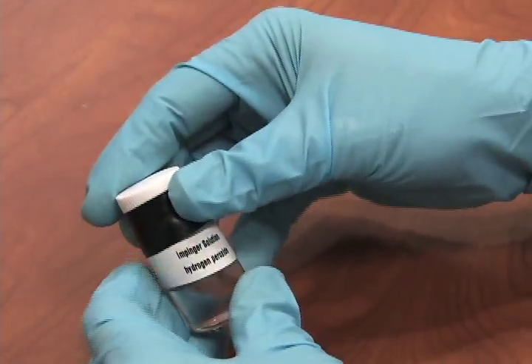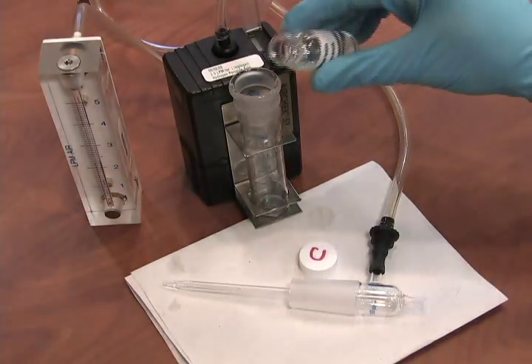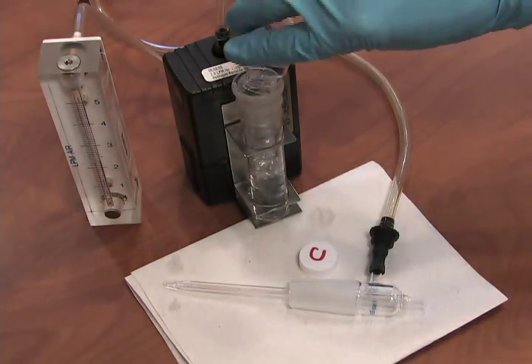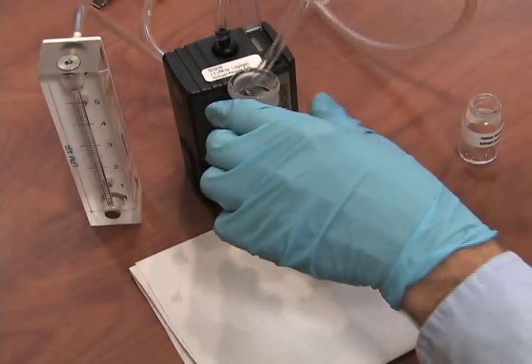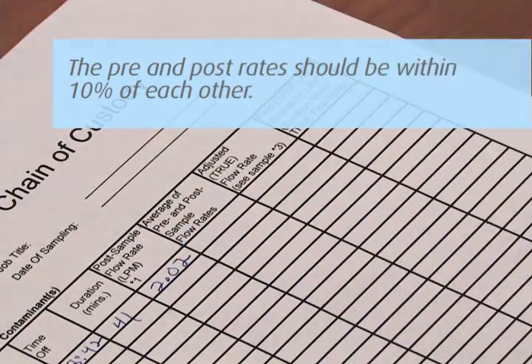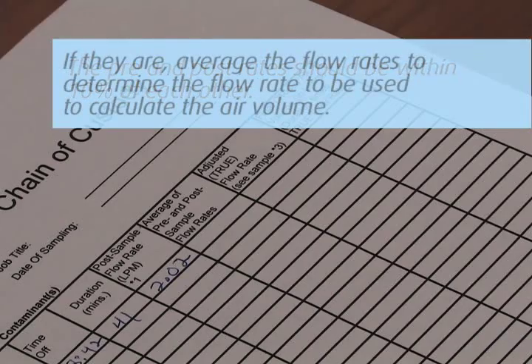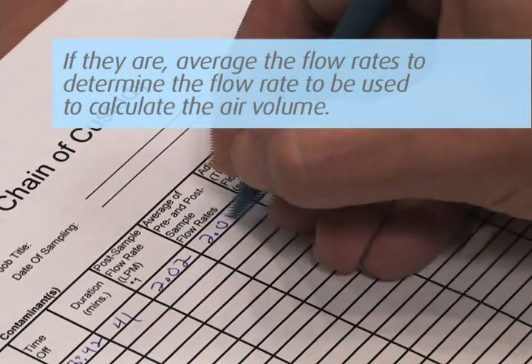After the samples are prepared for shipment, a post calibration must be performed on the pump. You can now perform the post calibration the same way you did the pre calibration. Just record the flow rate on the pump calibration sheet. The pre and post rates should be within 10% of each other. If they are, average the flow rates to determine the flow rate to be used to calculate the air volume.